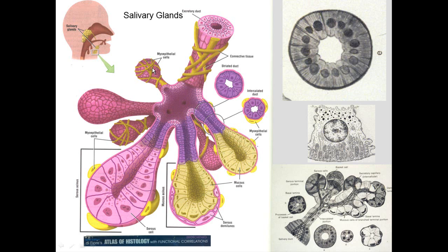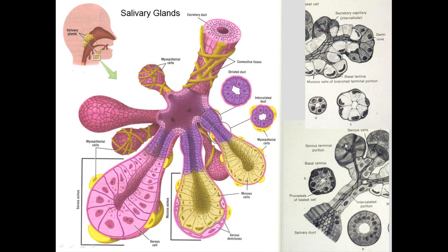You can see where they have wrapped around these myoepithelial cells that contract to discharge the contents within the lumen. So here we see a striated duct, one of these ducts in through here, and there's striations because you have infolding of the plasma membrane that you see here, and that lines up the mitochondria. So actually what we're seeing there is lined up mitochondria that gives its striation.